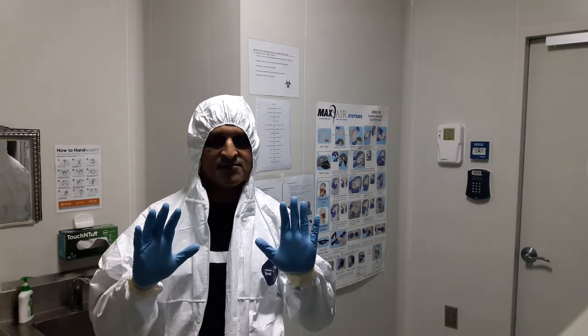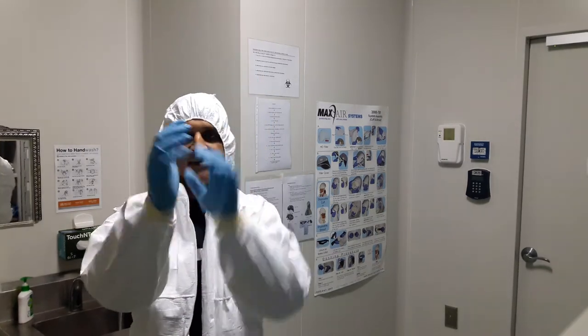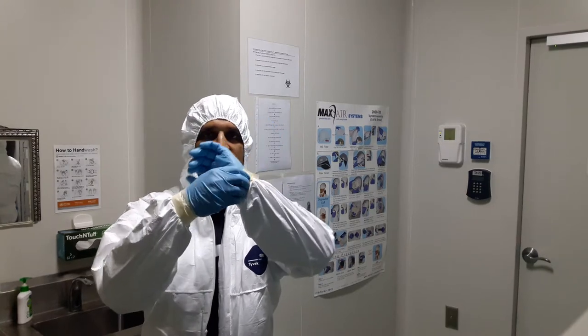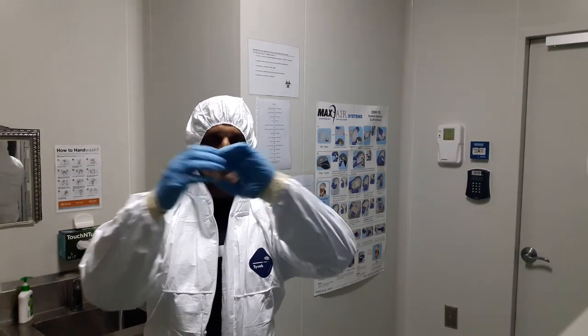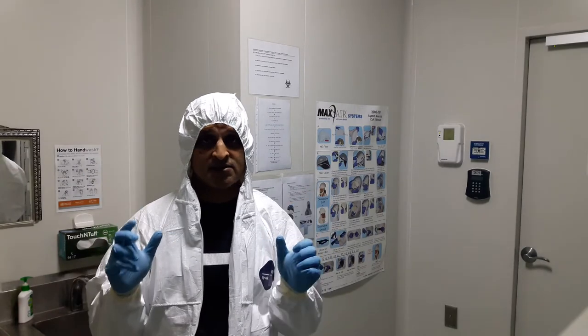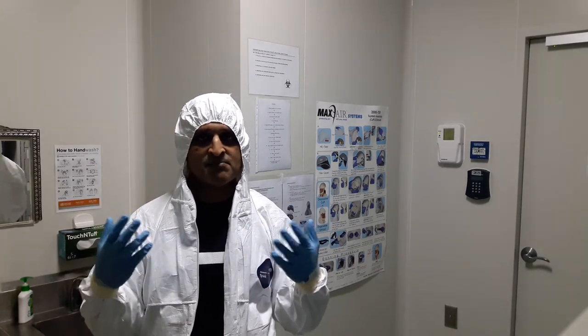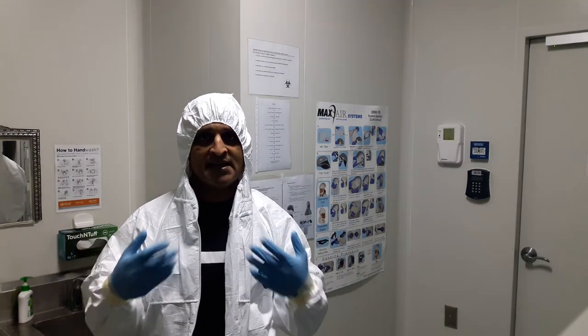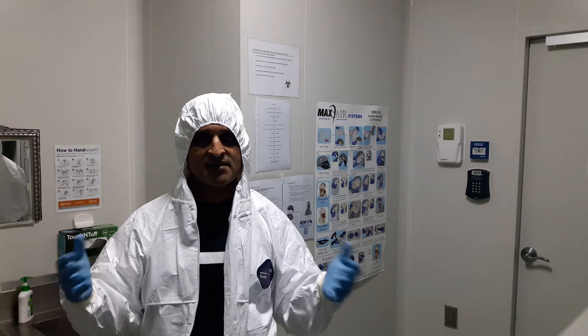I have a tie-back suit and I have gloves, and as you can see I have taped these gloves to my tie-back suit in order to prevent a breach of containment at this location. This tie-back suit is required when you are handling fluids — especially in today's example, I will be handling body fluids or VTM, viral transport media derived samples.